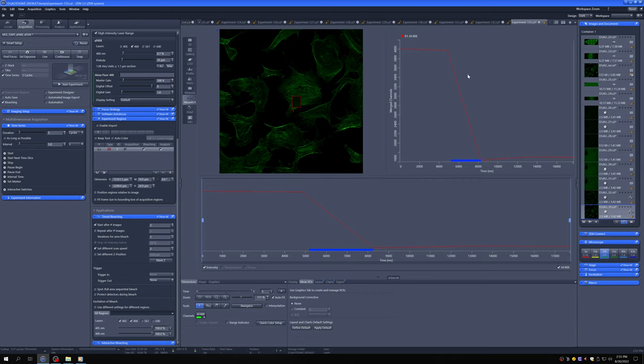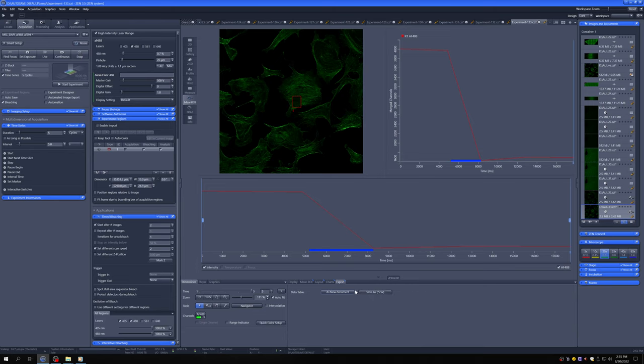Right there, and here you have a measurement of intensity. And if you want to see it on a different software, you can go down here and export this as a CSV file that you can then play around with in Excel or whatever your tool of choice is. So that's one way of doing bleaching.